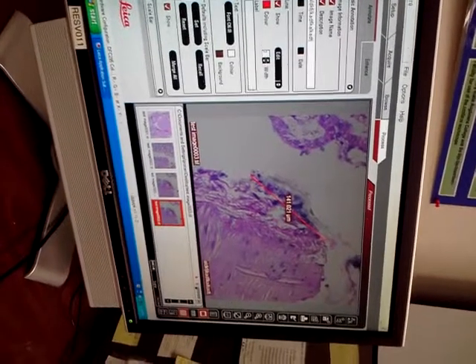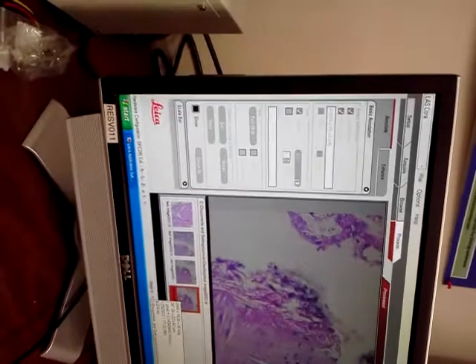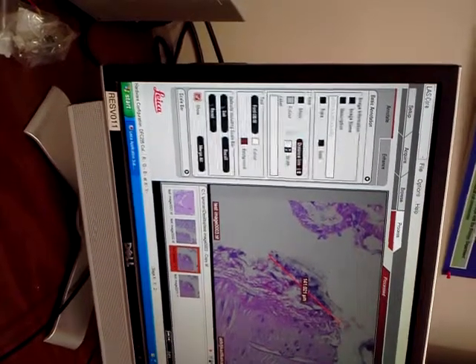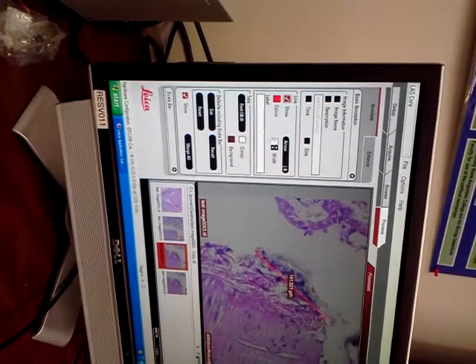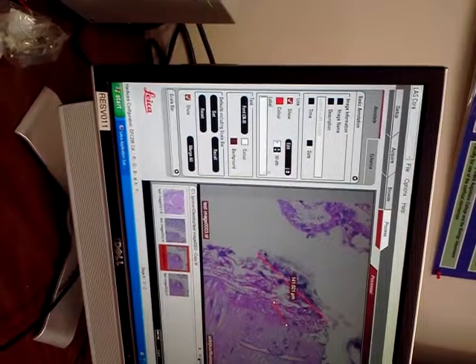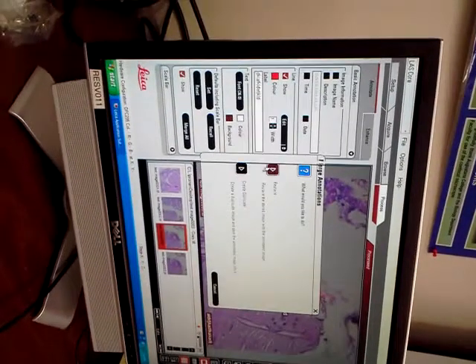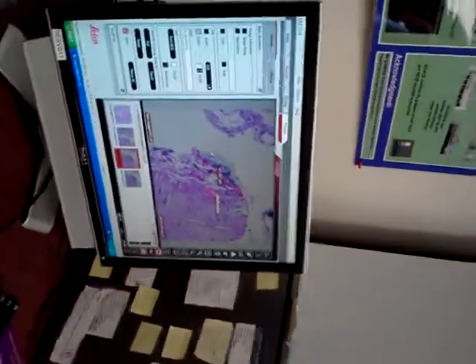However, on one, I can deactivate everything, which I'm going to do. So you have your original image, and then you use this one from here on out. It's permanent now. So now you can do an arrow, you can point to something, you can even label it, and then I'll merge it again, and this time I'll replace it. So now I can keep doing more measurements as I see fit. That's an easy workaround.